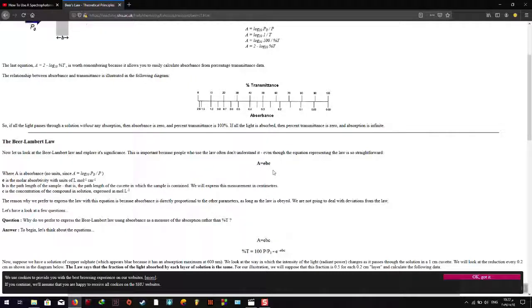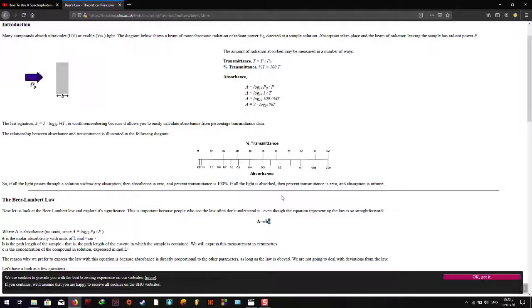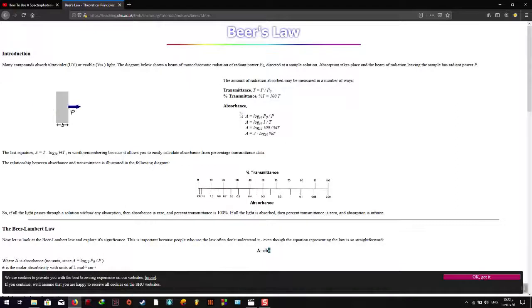So they could just easily calculate the weight of the sample before dissolving it in the solvent, and calculate the volume of the solvent, dividing the weight of the analyte over the volume of the solvent, and then you could get the concentration. From this you could get the absorptivity, or if they directly know the concentration, then we have the absorbance, and the concentration is known or calculated for the standard, so we could use it to calculate the concentration of the sample.